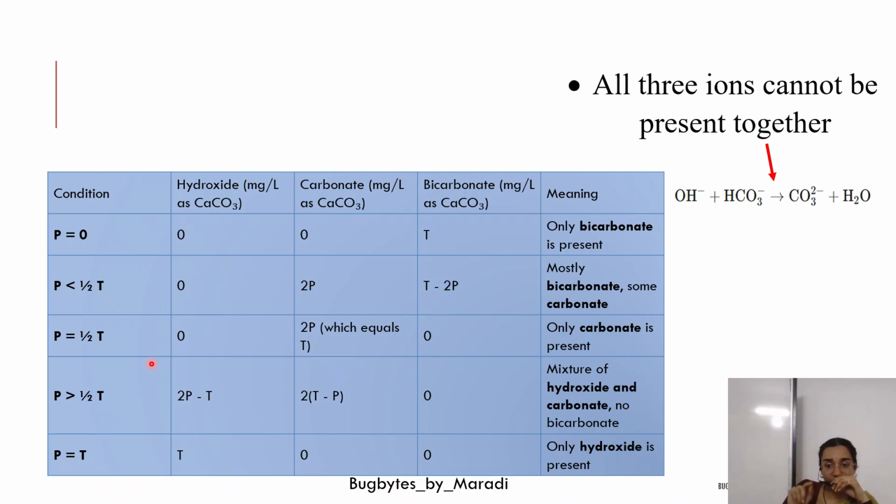If the pH range is 8.3 to 10, it is a moderately alkaline water sample, and mainly it contains carbonate. We have already discussed half carbonate. So carbonate and bicarbonate may be present. Coexisting is happening because carbonate, when it reacts with the acid, gives you the bicarbonate.